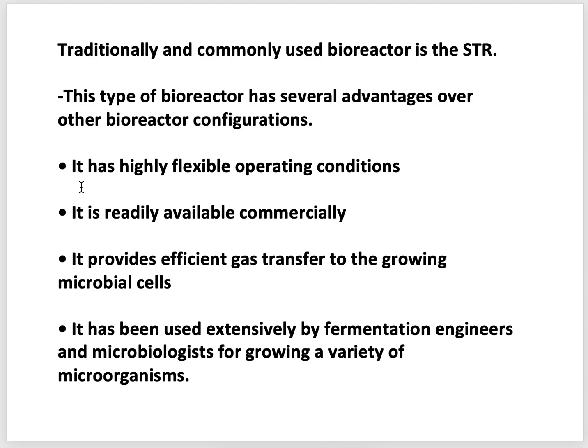What are those advantages? It has highly flexible operating conditions. You can change the operating conditions. For example, you can change the speed of the rotator, that means you can change the speed of the impeller or stirrer. You can change the pressure or velocity of the incoming air. So you can control this very flexibly. With high flexibility we can operate the process.